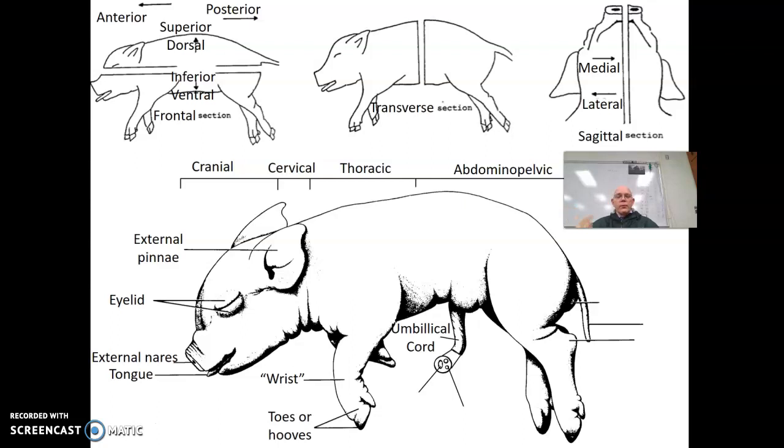When we look at our umbilical cord, we will try to see these three blood vessels. You can't always see them, but we will try. There's one, the umbilical vein. This is the big one by itself. If it's colored, it should be blue, if you can see that. Some you can and some you can't. But the big blue vein is the one that ran up to the liver, and when you were cutting open the pig last Friday, we were trying not to cut. That's this big umbilical vein.